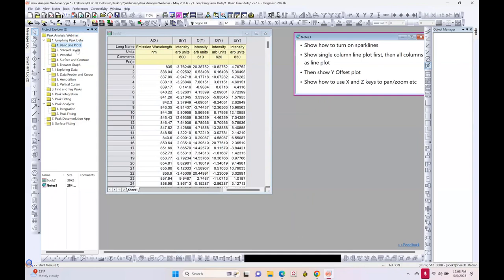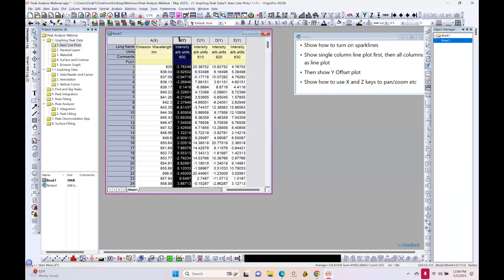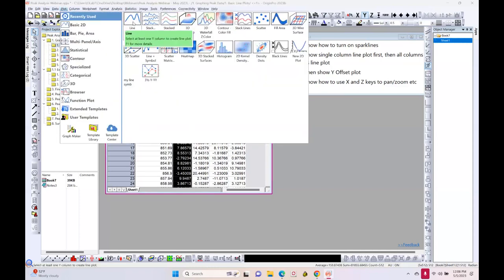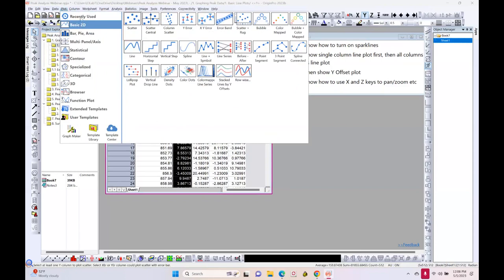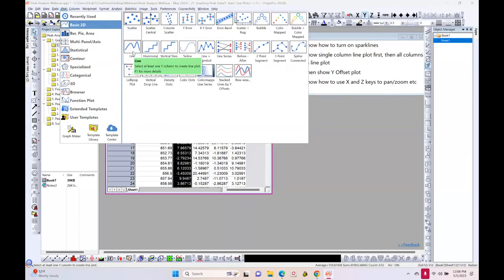Before we get into analysis of peak data, I would like to start with some basic graphing — different types of templates, how to explore data, et cetera, before we get into finding and fitting peaks. Here I have a worksheet with one X column and multiple Y columns: some measurement of excitation intensities as a function of emission wavelength.